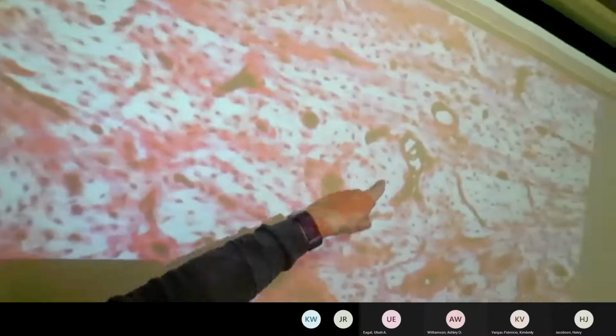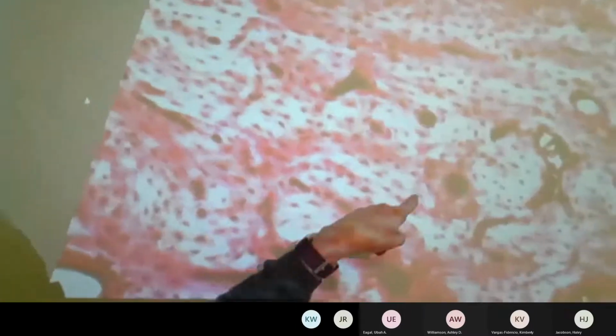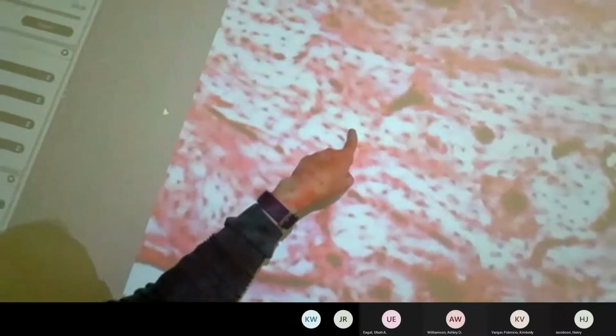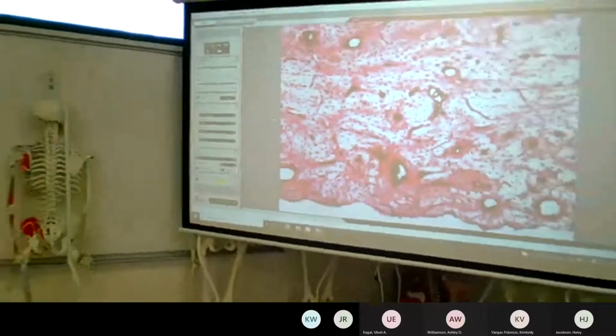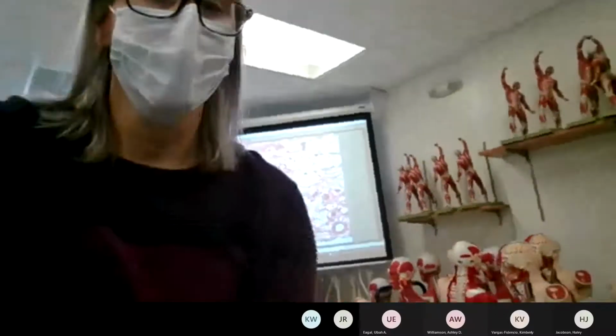All the little dots there, those are your osteocytes. And the white material they're embedded in are your lamellae. And remember, you can see some of them have these protrusions. Those ditches in the lamellae are known as canaliculi, and they are dug by the cell to try to reach closer to the blood supply.